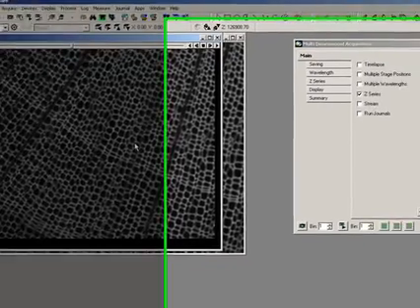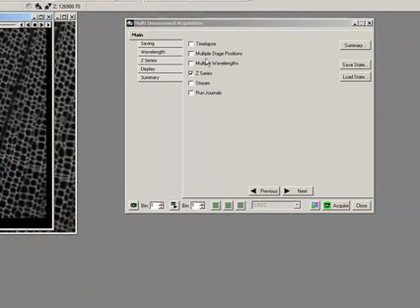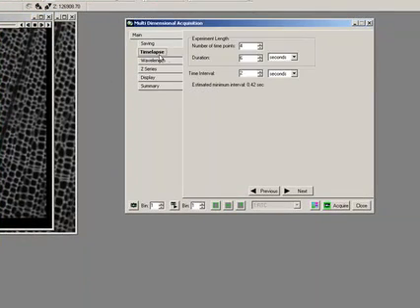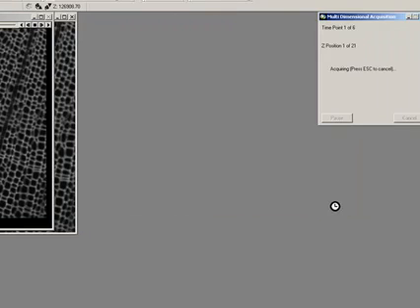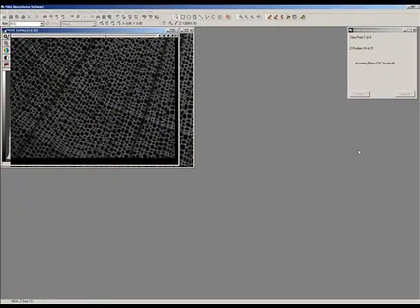So when I'm doing a time series of Z stacks, which I can do by pressing time series, and we'll just come here, and we can say do this every 10 seconds. When I go and do this, which I'm just going to do now, it actually does the acquisition and leaves me in the middle, so I know that I'm in focus for my next acquisition.